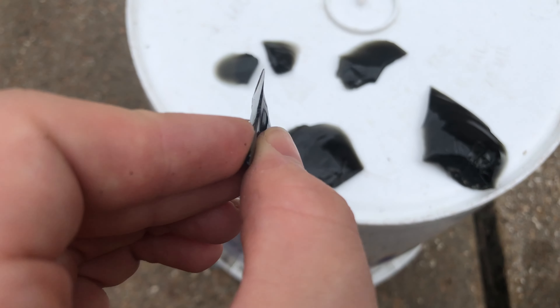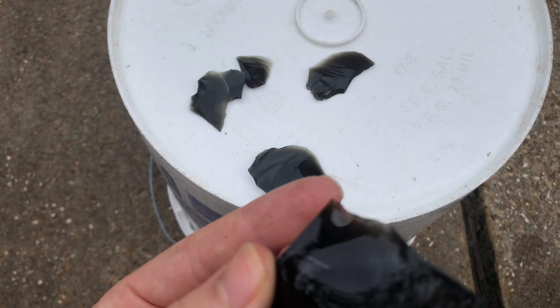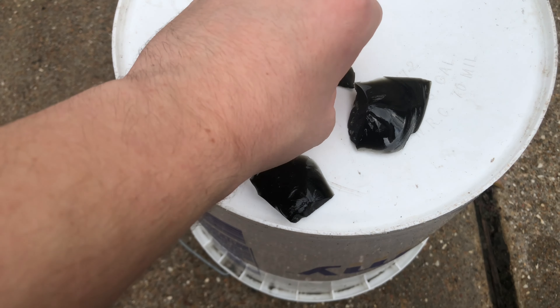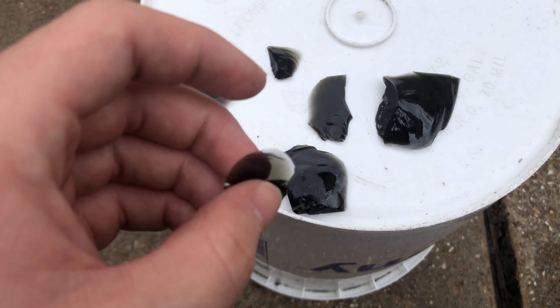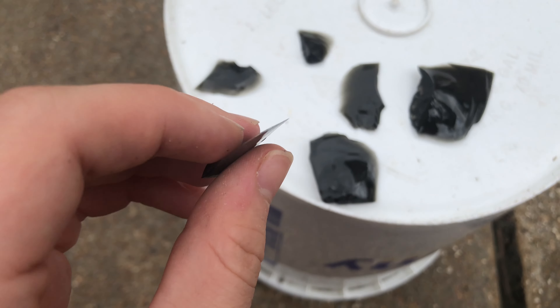Some of them are pretty sharp. I have this big one too that has a point which I think will be useful. So it looks like this is my toolkit for my pig dissection. I'm going to get ready to open up the bag with the pig in it and then dissect it with these obsidian tools.